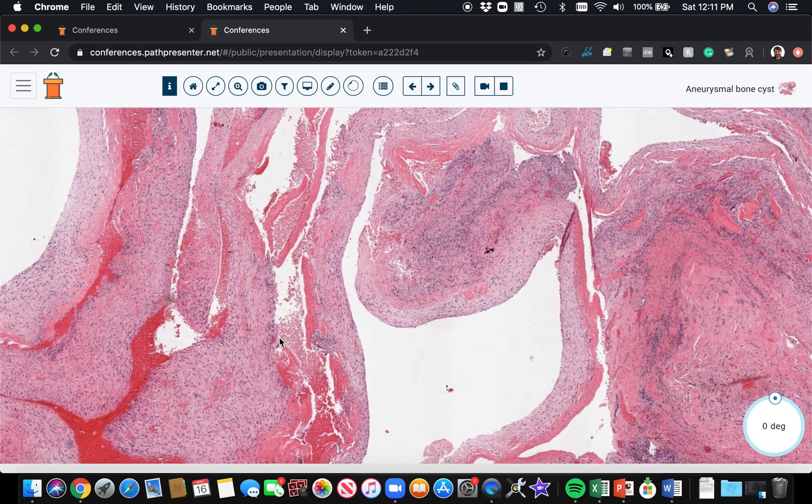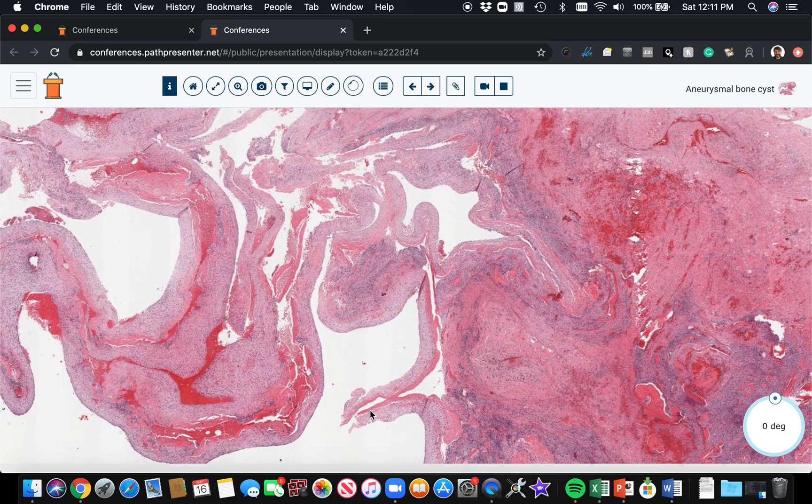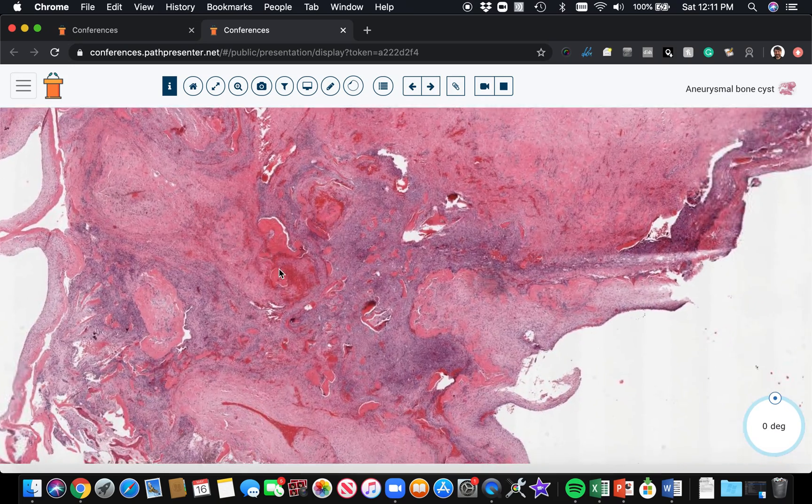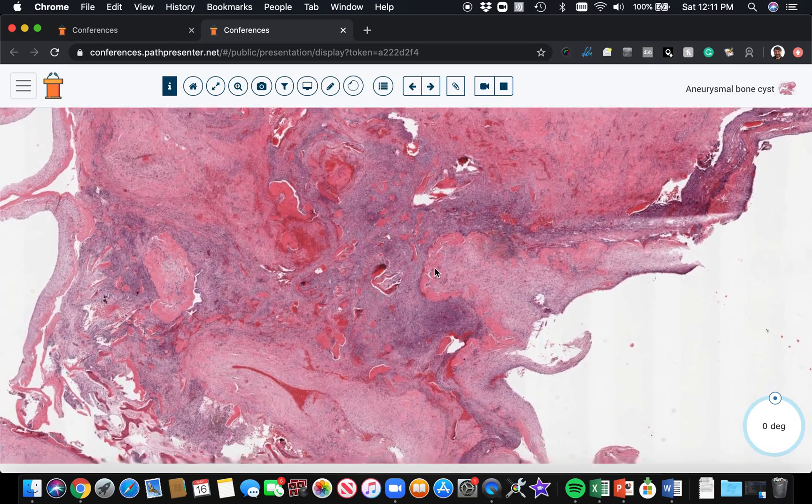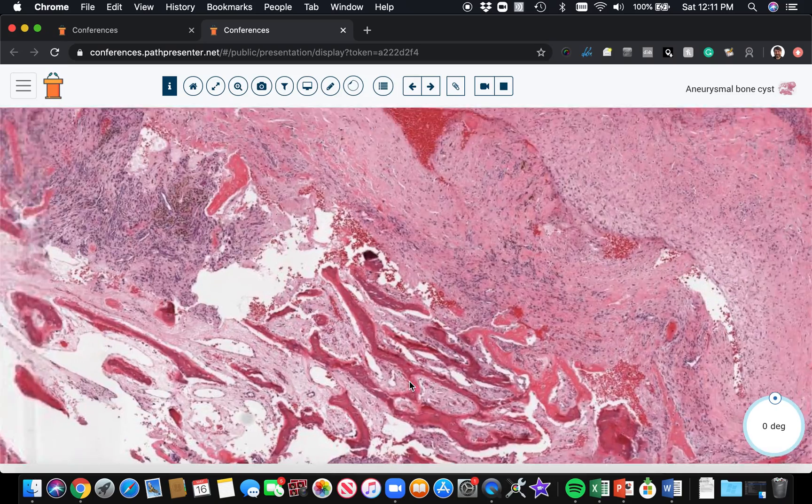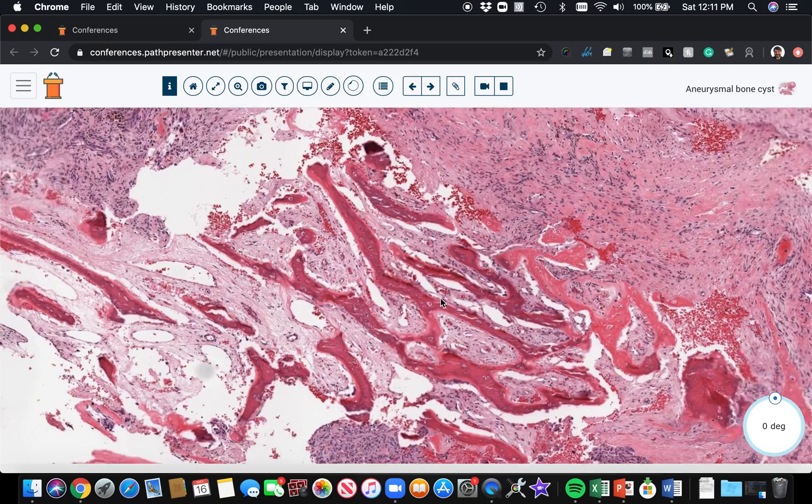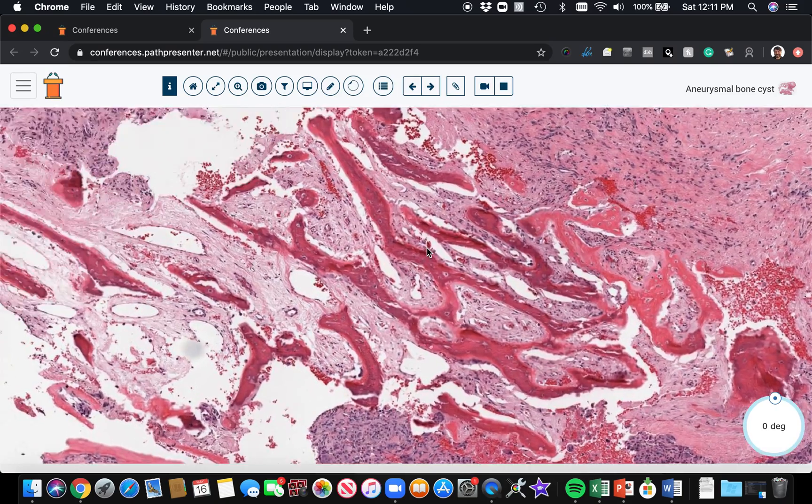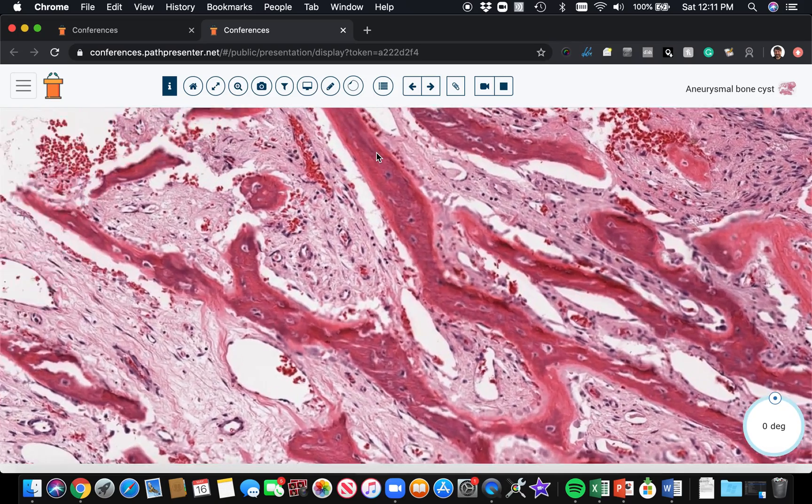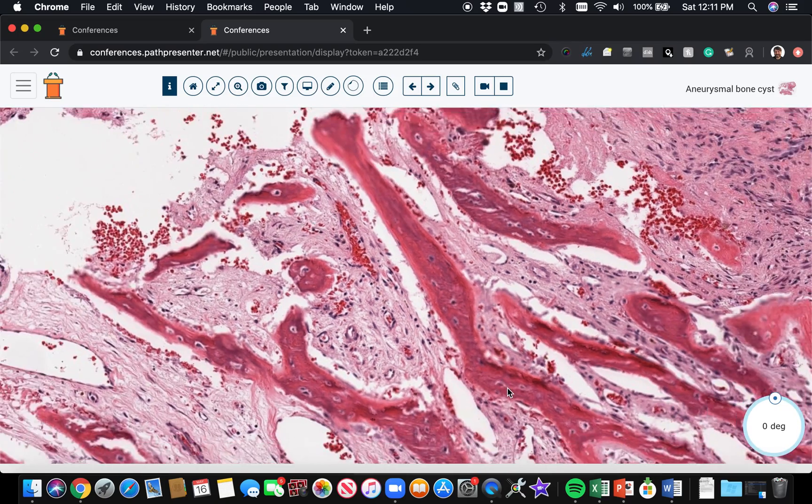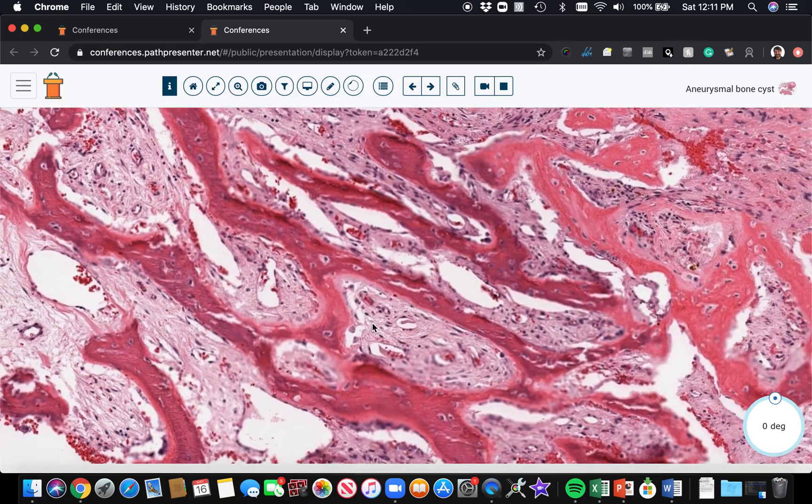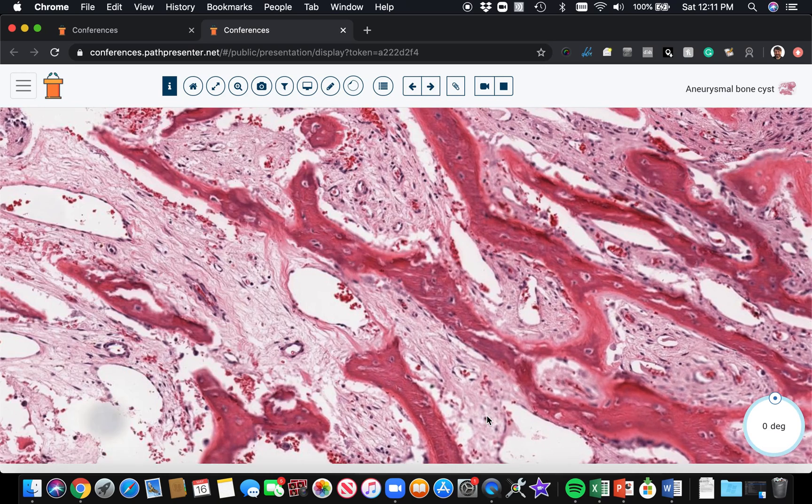Okay, so we've talked about the septal lining, the blood-filled cystic spaces. There's often a lot of new bone production, a lot of reactive woven bone formation in and around aneurysmal bone cyst. Here's woven bone - these little islands of bone.